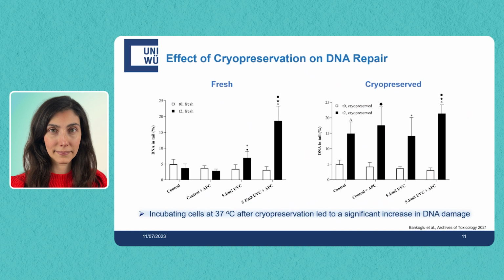So what we also wanted to see after that, so we can count on that, we can analyze the FPG comet assay and alkaline comet assay data with the fresh and cryopreserved samples. And if we have PBMCs, we can even do the ex vivo H2O2 challenge, and it looks positive. What about the DNA repair activity?